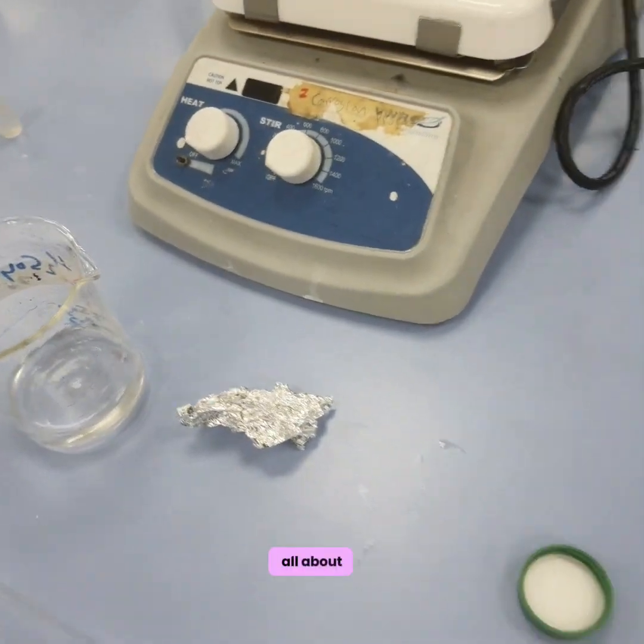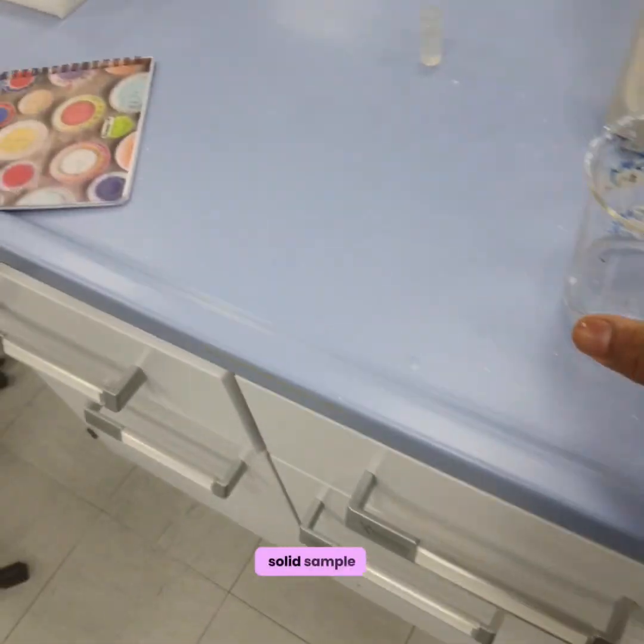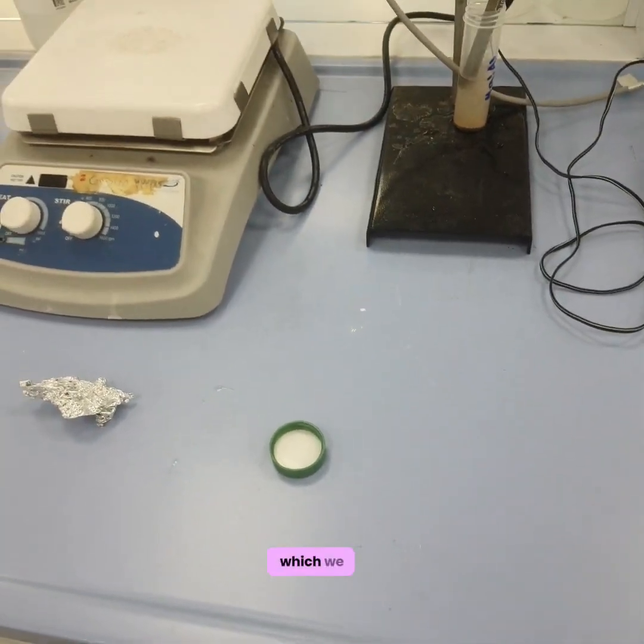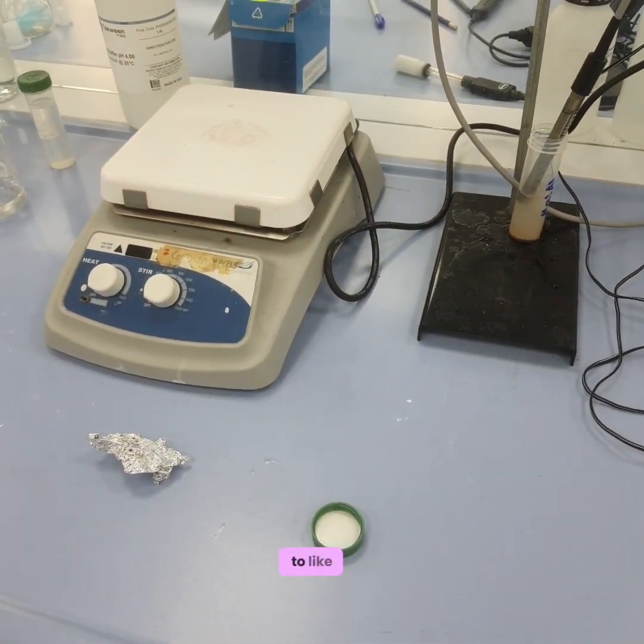This was all about the pH of the solid sample. And we should also know about the nature of the solid sample for which we are going to find the pH.